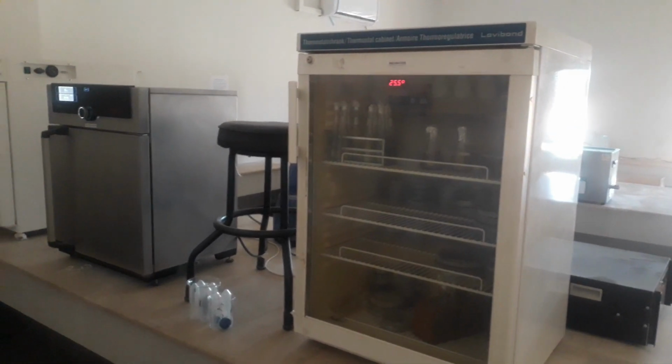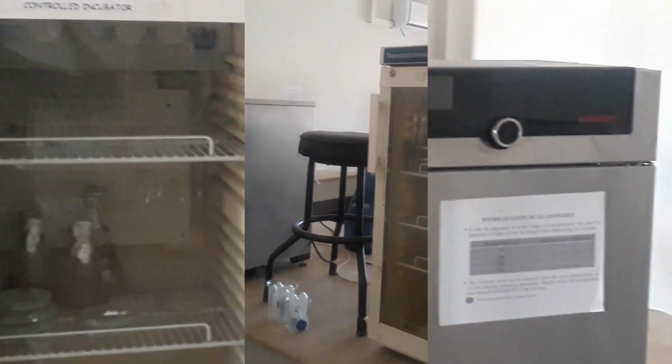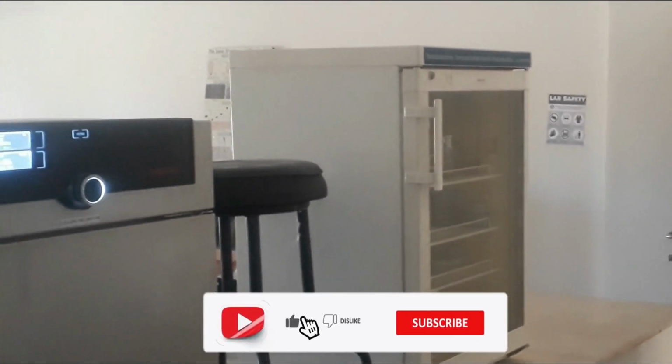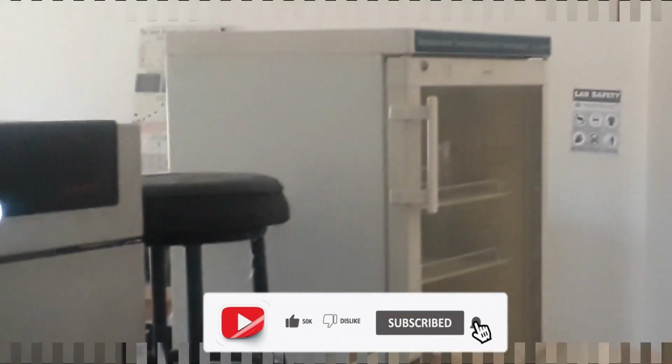In the laboratory, incubators are essential equipment used for various experiments and research. These incubators provide controlled conditions such as temperature, humidity, and lighting to support the growth of biological cultures.